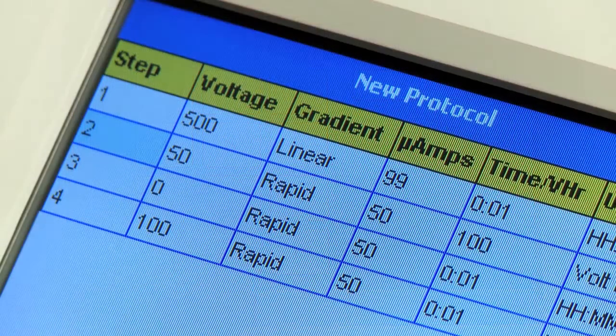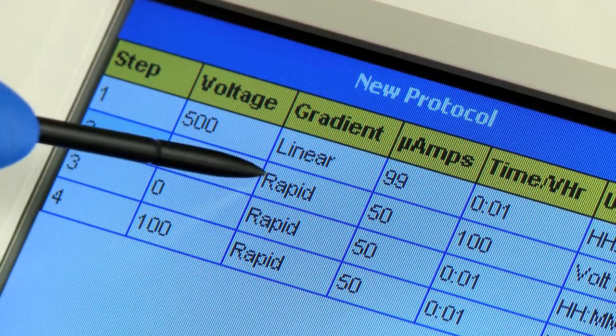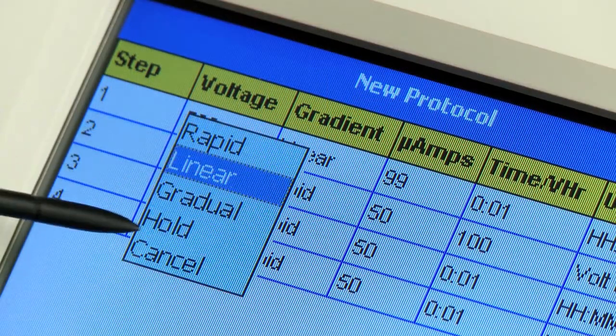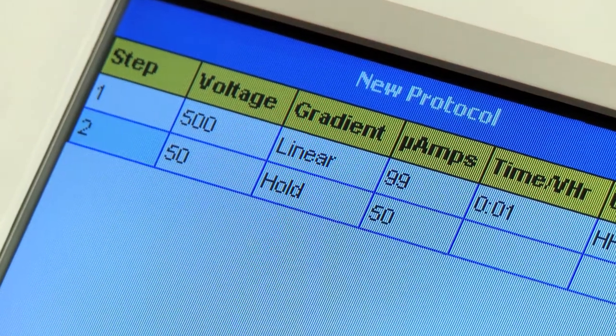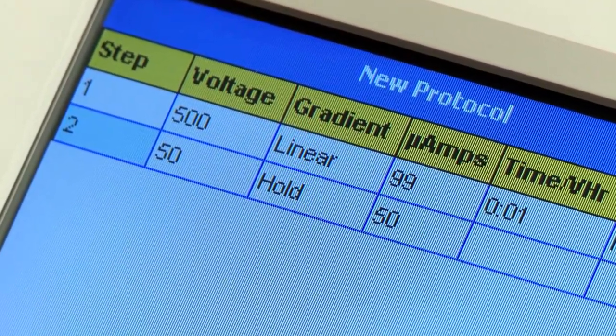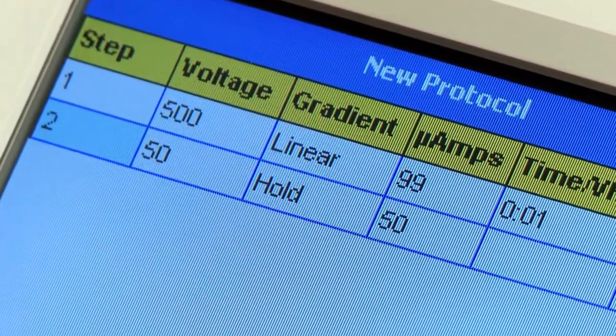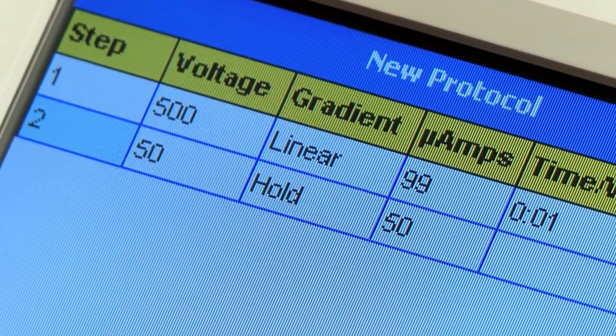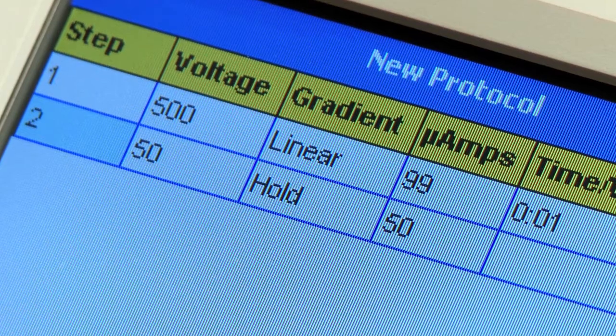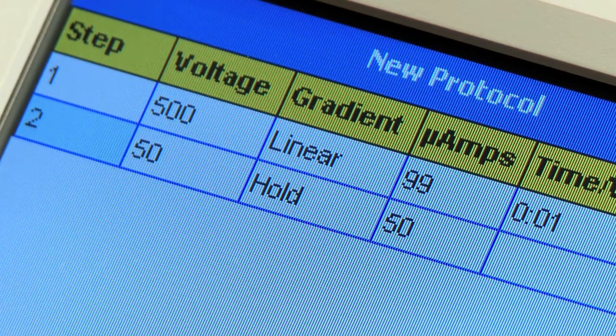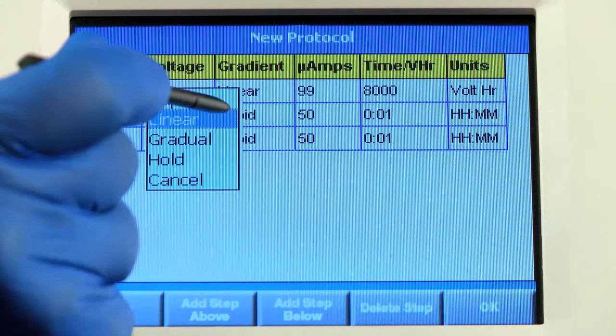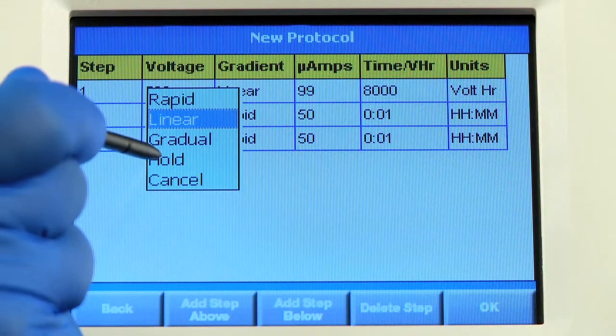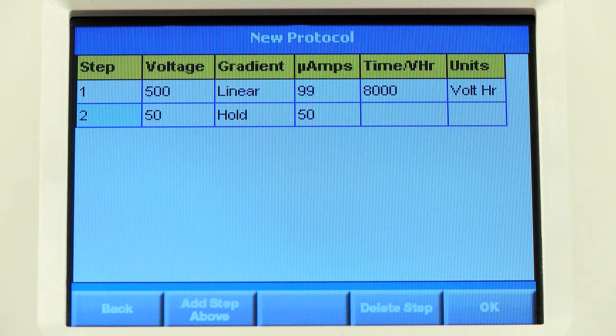One of the options under the gradient column is Hold. This will run the system at the current and voltage you set indefinitely, so that your samples remain focused if there is a lag between when the run finishes and when they can be removed.